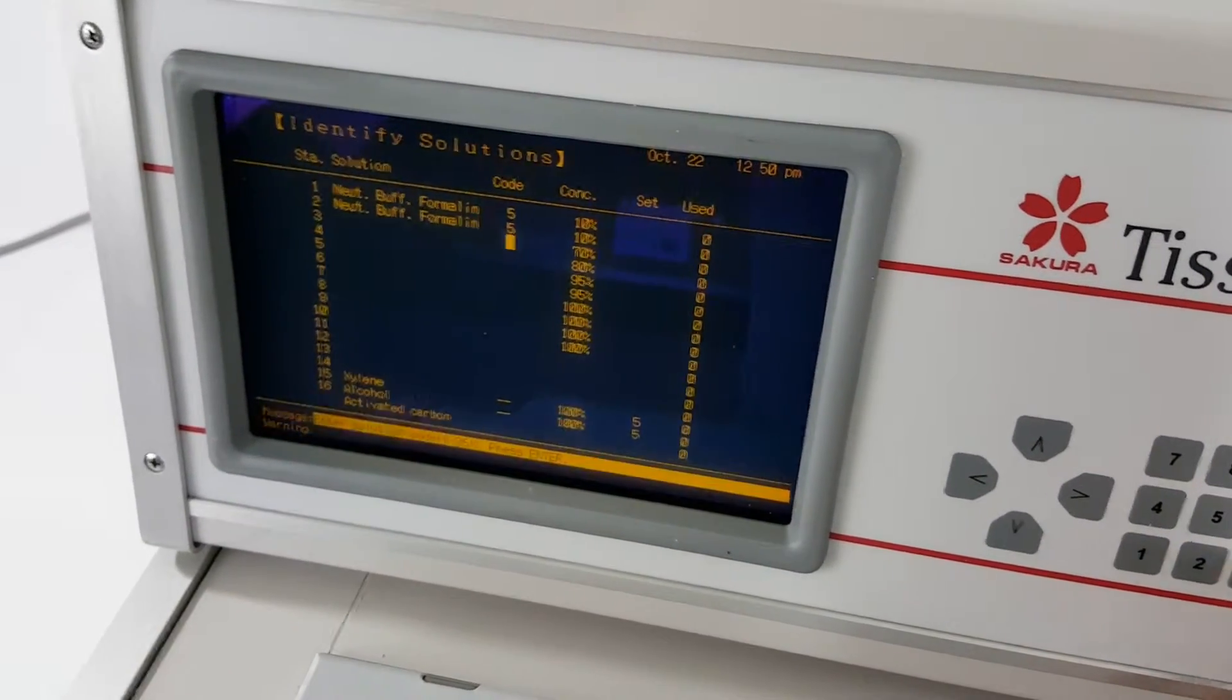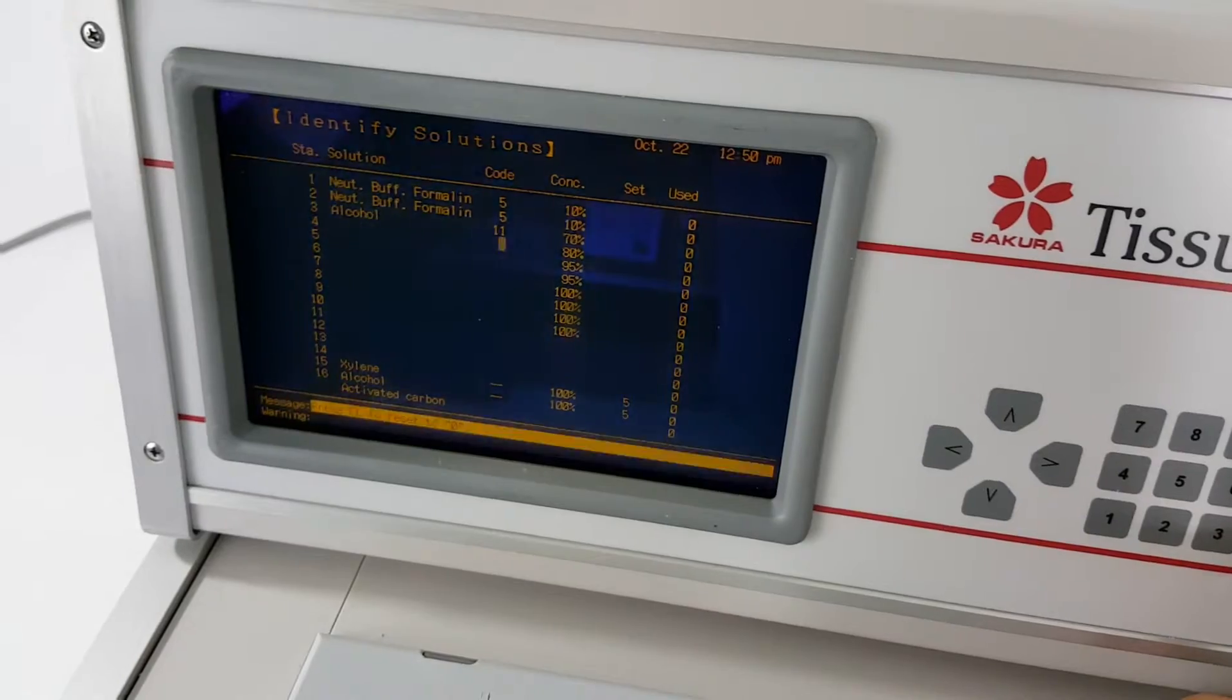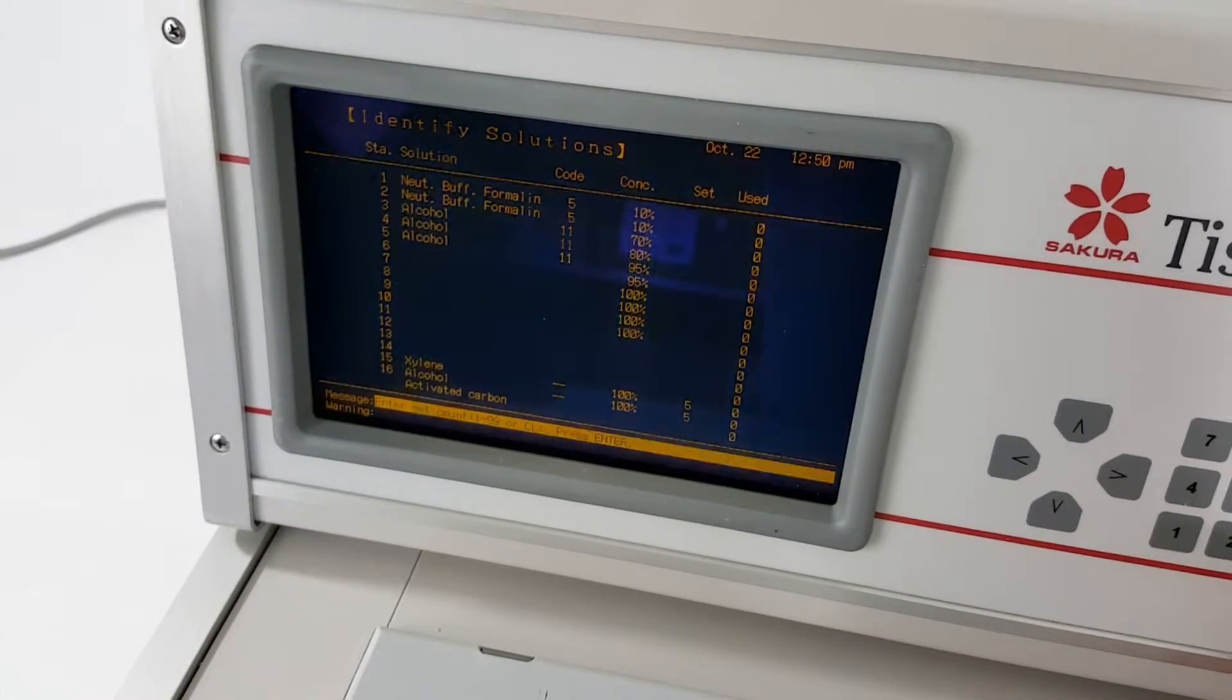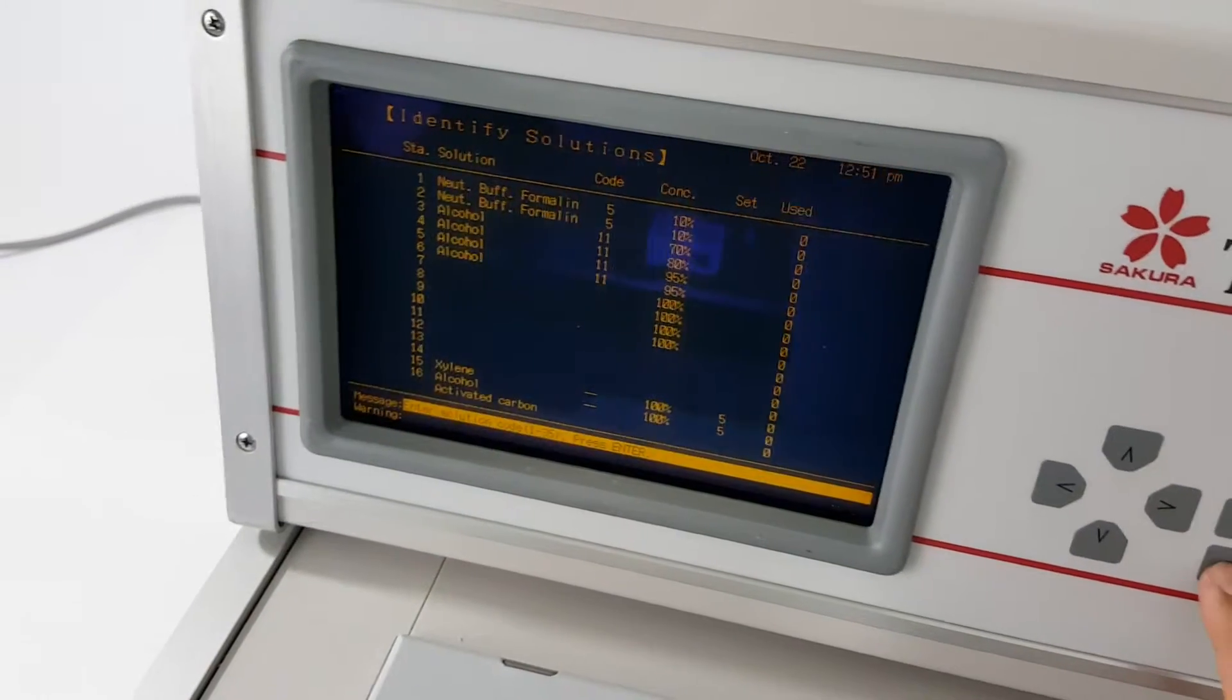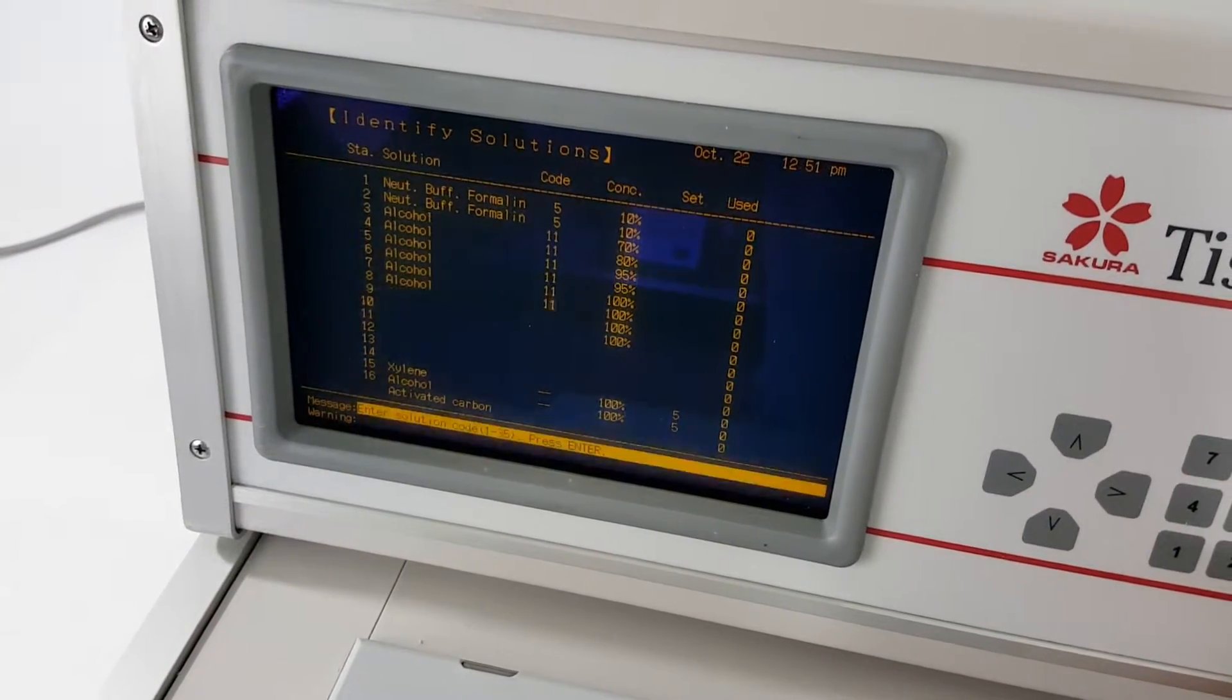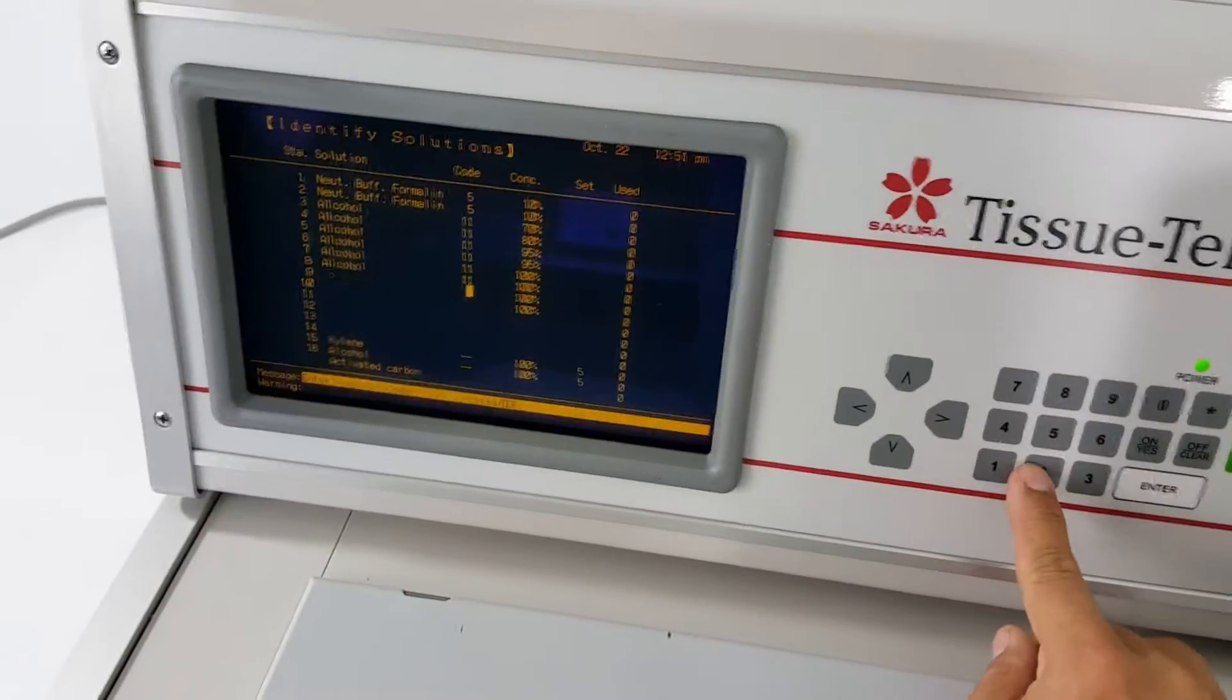And then alcohol is 11. And then the last two are xylene and that is 20.